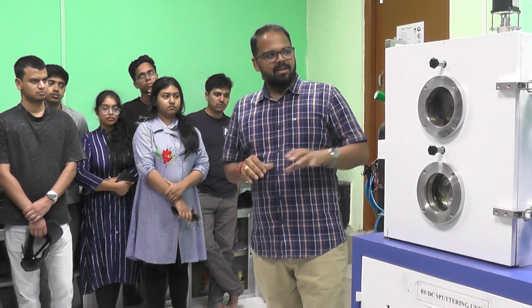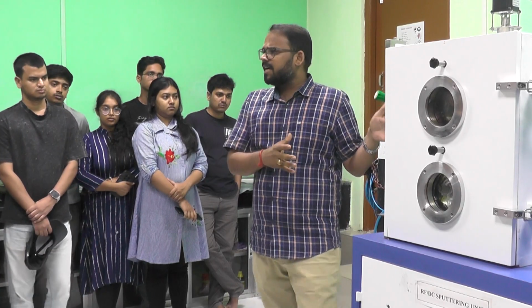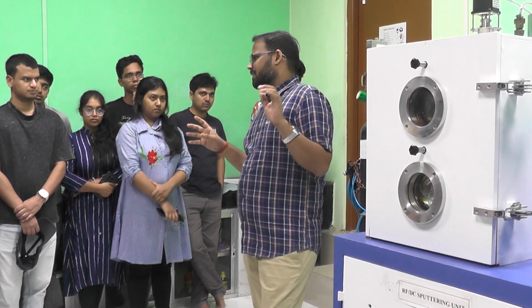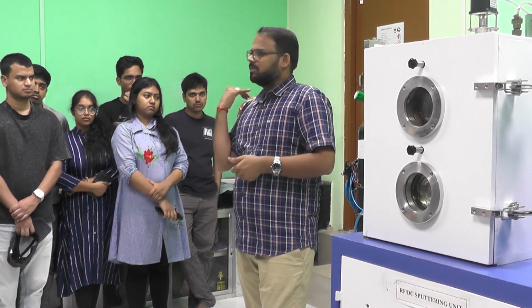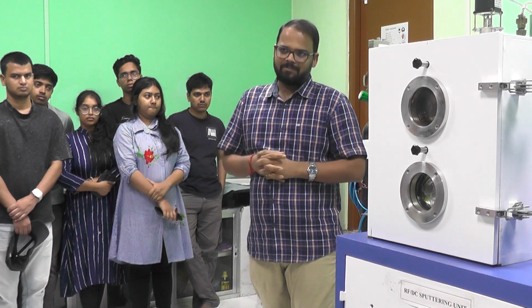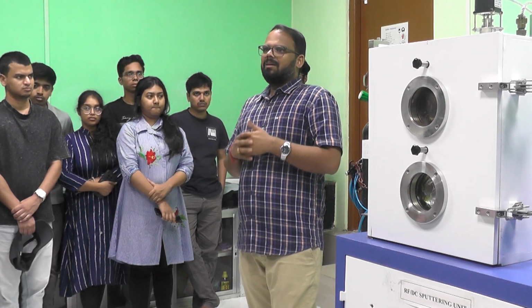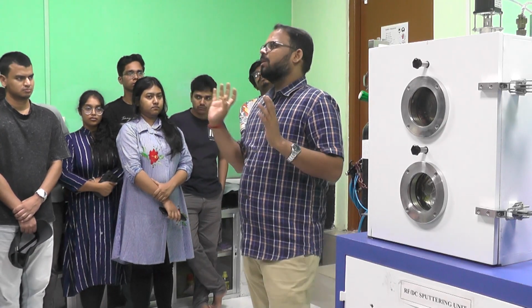Okay, so here you just visualize this setup. This is a standard PVD technique. This is part of the PVD technique. Probably those who are taking the VLSI course, microelectronics course, and who are doing semiconductor research, PVD technique is one of the very important and basic instruments, by which you can prepare your materials, silicon, and all metals, everything you can coat and prepare.